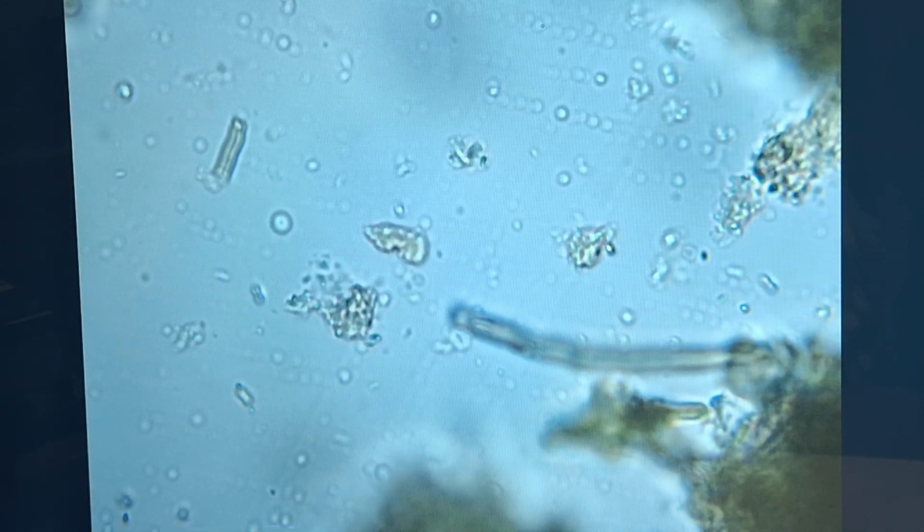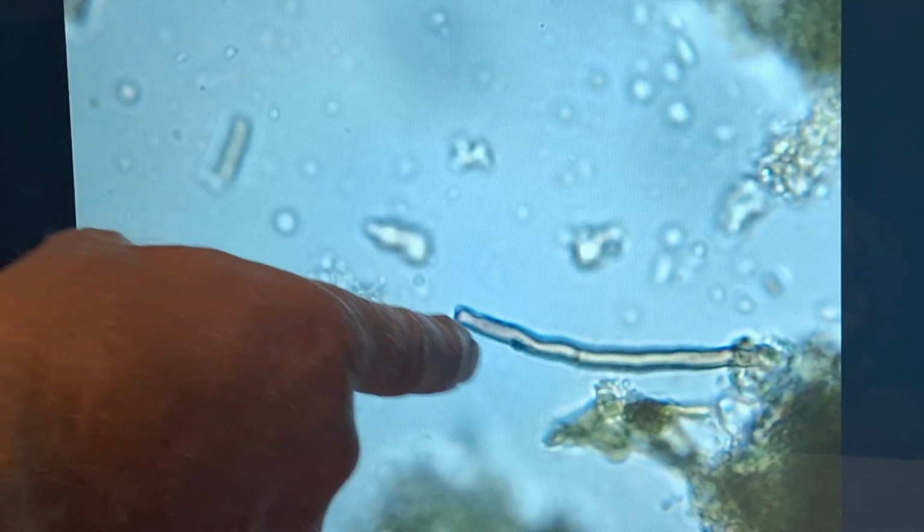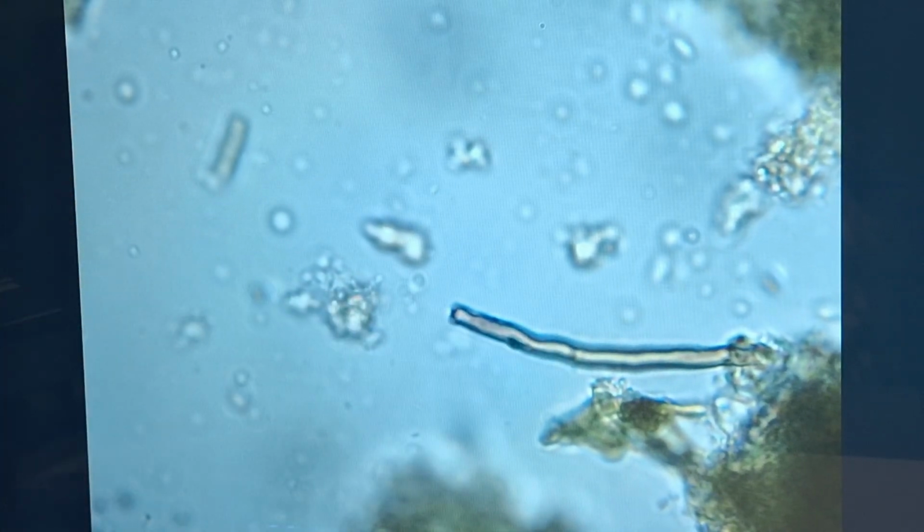So we focus in a little bit to the bottom right here. We can see a nice piece of fungal hyphae there.